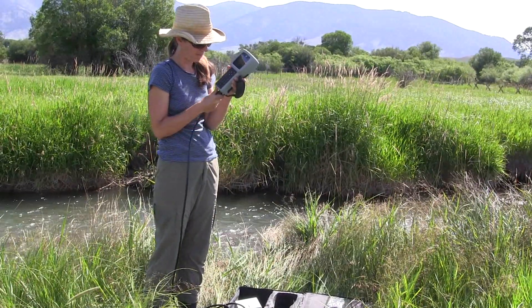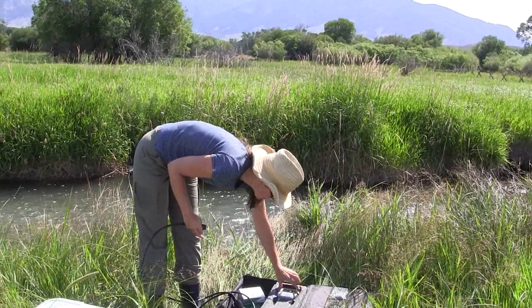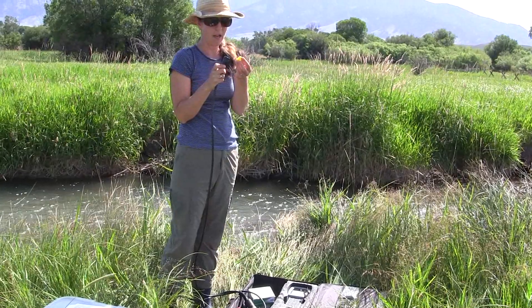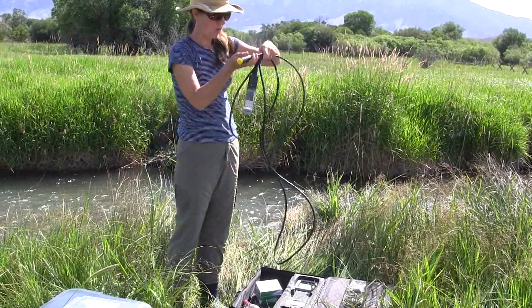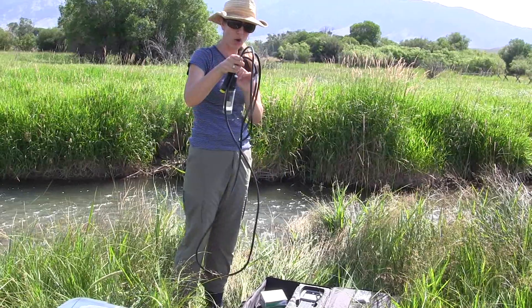Then disconnect the probe from the meter, put the meter part back in its designated spot in the case, and protect all the pins on the connection end of the probe with the yellow cap that's included. Carefully wind up the cord and store it back in the YSI case, and you're good to go.